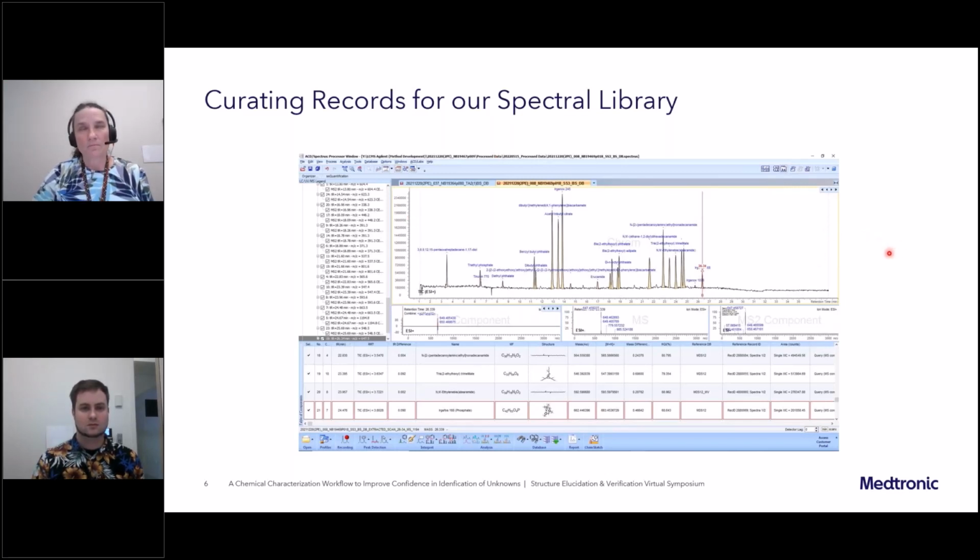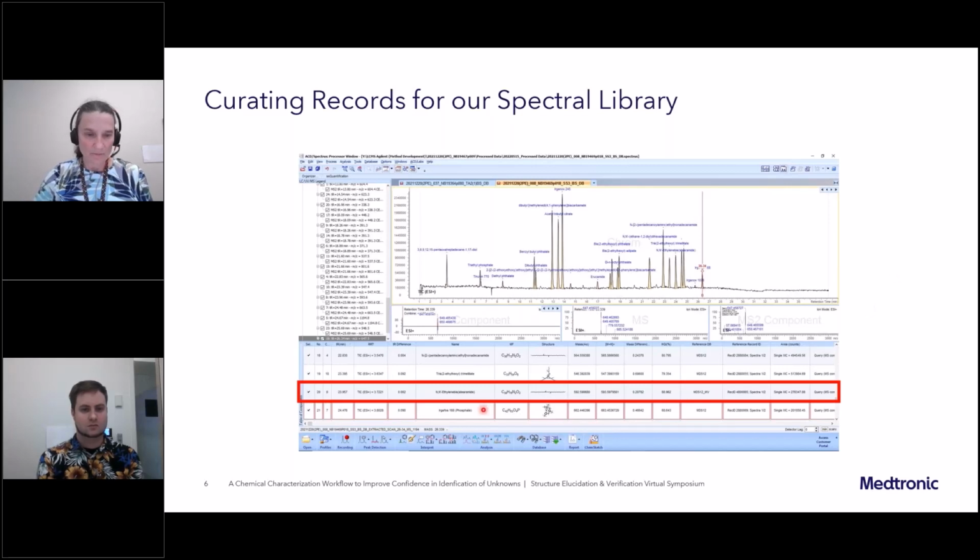We will make different concentrations of that reference standard, and we will expose it to our chromatography. And in this case, I'm just showing all of it in our system suitability standard. However, the one that we're going to focus on right here is the N,N-ethylene bisstearamide.